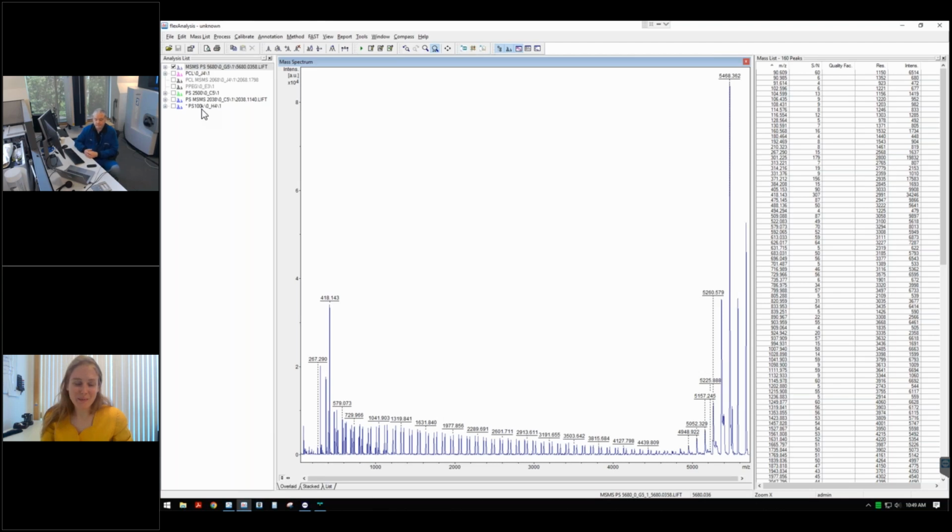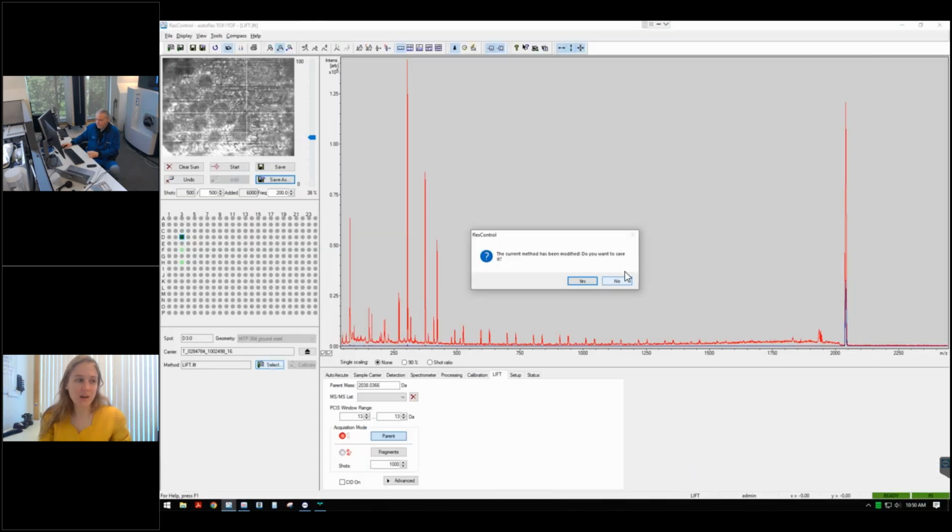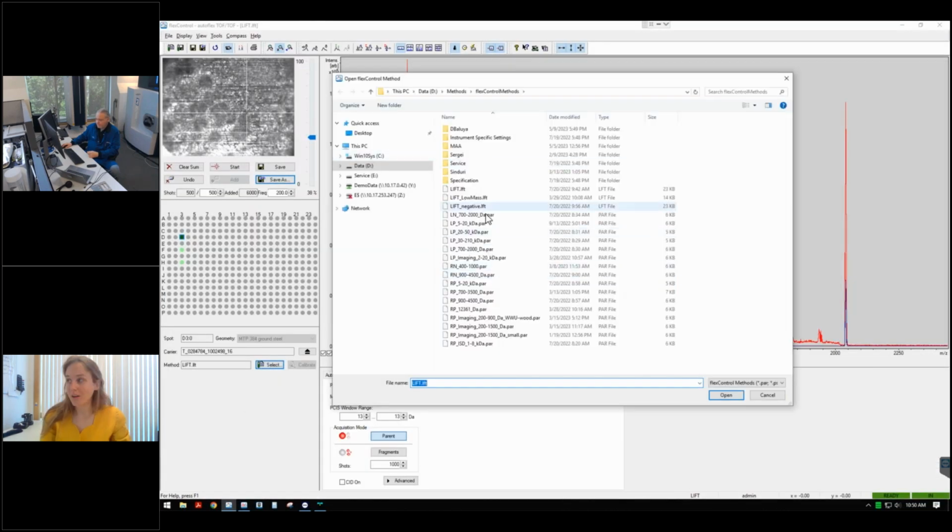Thank you, Mark. Thank you very much. Great presentation. Appreciate the demonstration and walkthrough. We have a couple questions here in the chat box. I'll start with the shortest. What are limitations to MALDI?